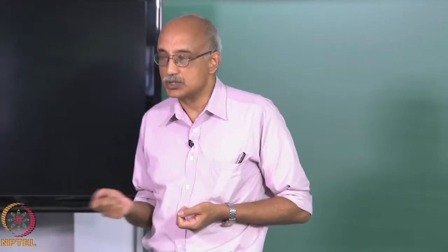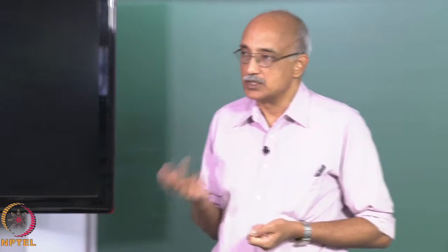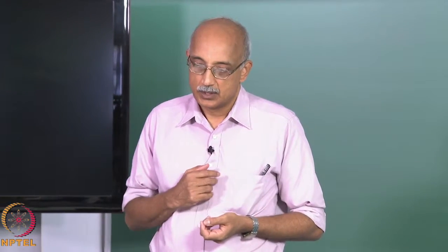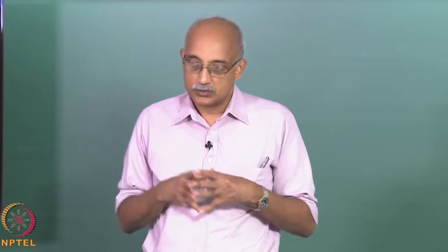So for example, in the case of inorganic materials, if you want to increase your magnification, your resolution, your precision of the imaging, you go to techniques like SEM and TEM and so on. You can also do depth profiling by using techniques such as Auger spectroscopy and SIMS. And we also mentioned that you can do not only elemental composition analysis using techniques like energy dispersive spectroscopy and wavelength dispersive spectroscopy. You can also do compound level analysis to identify species by using ESCA as the primary technique.